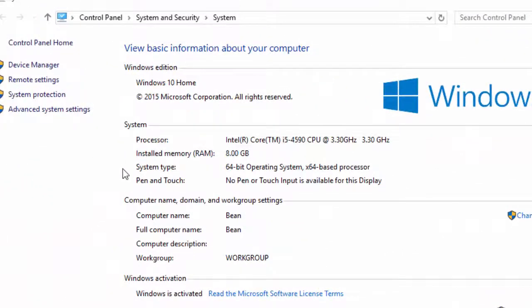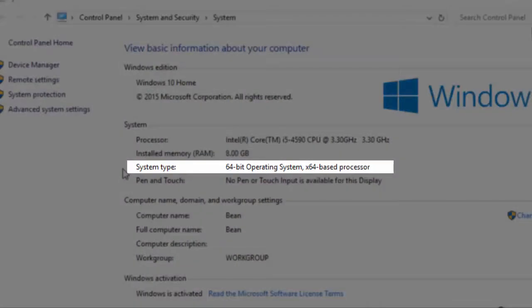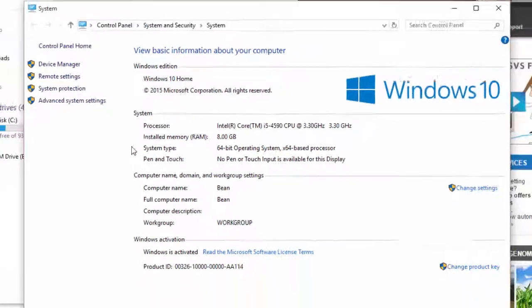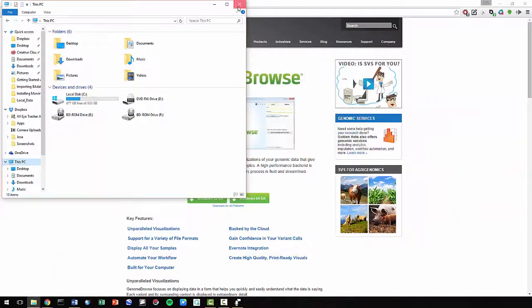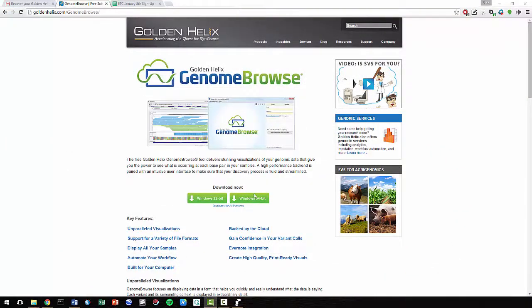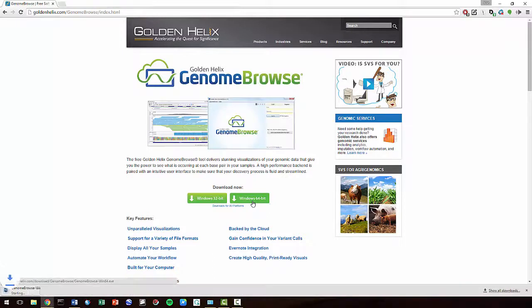My computer is operating on 64-bit, so I will download the 64-bit version. If you're operating on 32-bit, then you should download the 32-bit version.